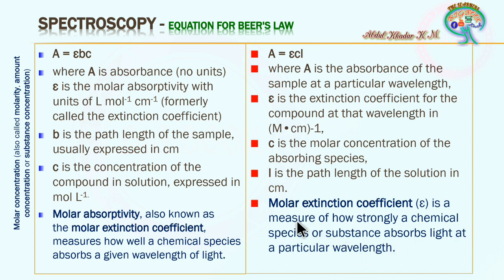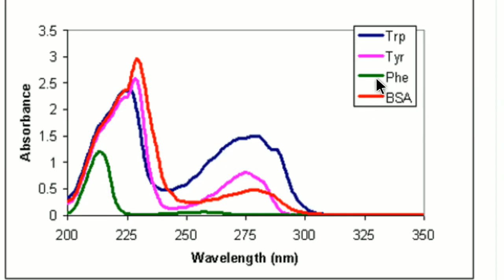Now here, when you subject a particular compound to a wavelength range of 250 nanometer to 500 nanometer or 900 nanometer, at a particular point the absorption of that wavelength by the substance is going to show a peak. So here, we will consider this green curve.